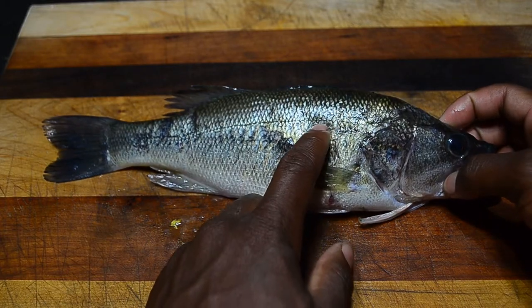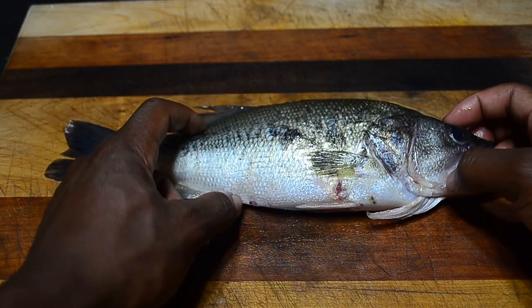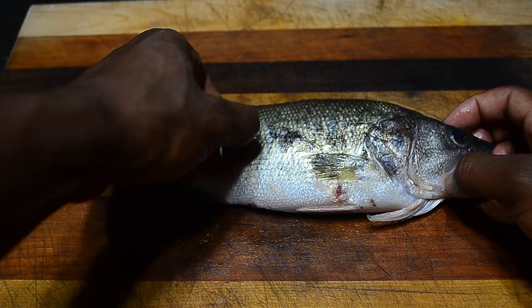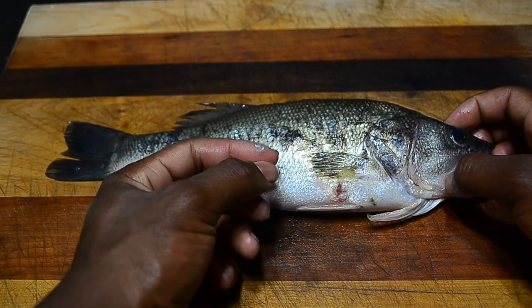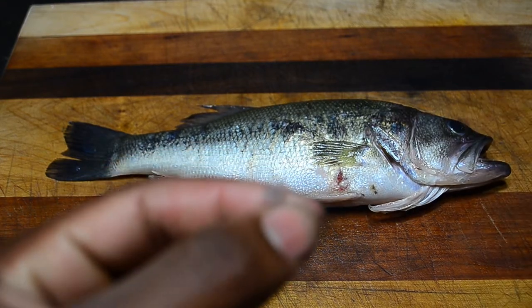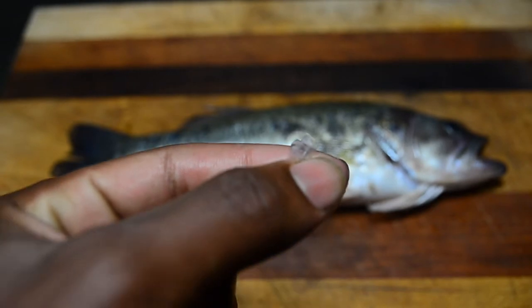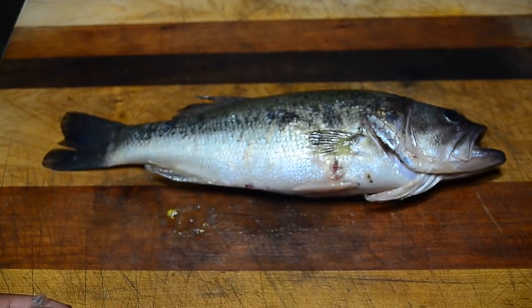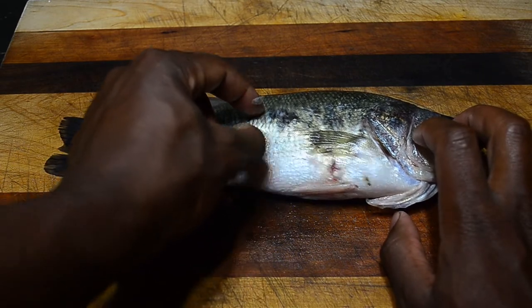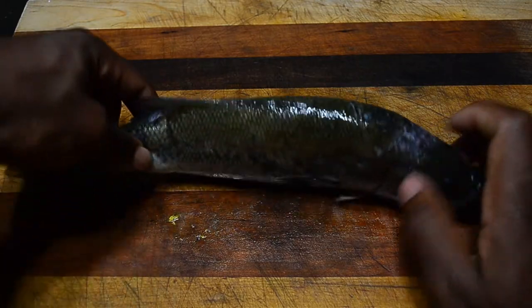You can see the lateral line right there. Unlike catfish, which didn't have any scales, bass do have scales — specifically cycloid scales. These scales are very thin, not thick at all, and provide a decent amount of protection. They come off very easily but they grow back, so that's a plus.